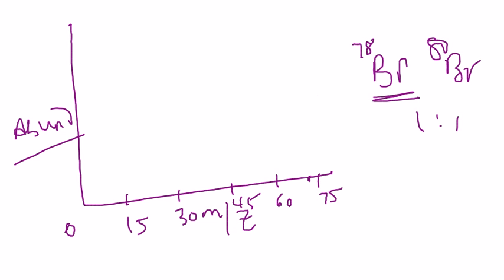That's how they exist. So in case of the mass spec, if it does contain bromine, you will always see an M, and then you will always see an M plus 2, both of which will be of the same height because it's 50-50. On the other hand, once that bromine is lost, the abundance is going to change. But bromine containing compounds will have this very typical pattern.